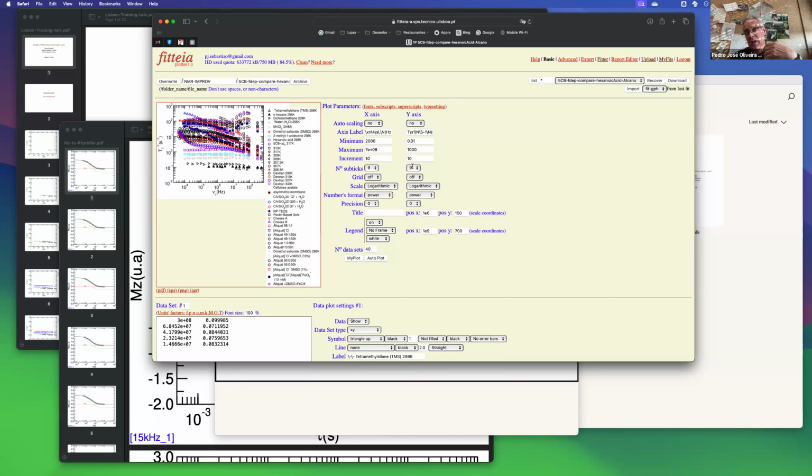This is the first question, and then, depending on the answer or on your assumptions, comes the discussion of the data. If you have two components, does this mean that you have two spin populations that do not communicate with each other, so they are completely independent populations, and the amount of spins in these different areas does not change and does not show any behavior that, by some coincidence, produces a relaxation rate that overlaps?